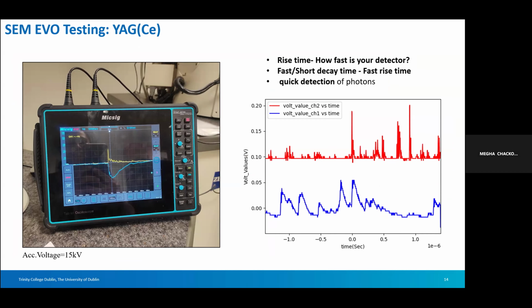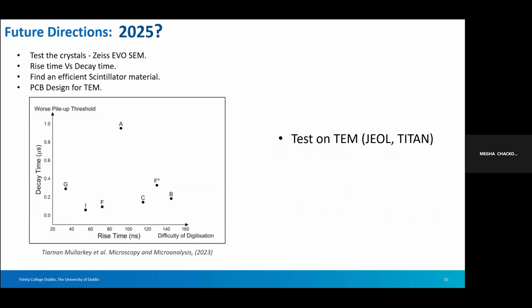Why are these pulses important? The pulses help me analyze the rise time and decay time of the scintillators. These rise and decay times give me information about how fast the detection is happening in a scintillator. Currently we are testing the different scintillators that I have chosen. The six crystals should go on the SEM, and I should get information about the rise time and decay time, so I can make sure how quick the detection is with these scintillators.